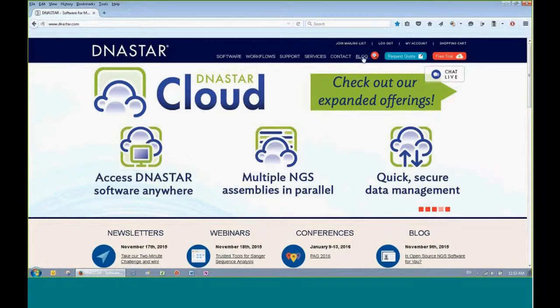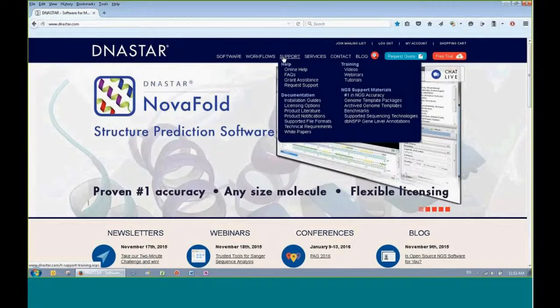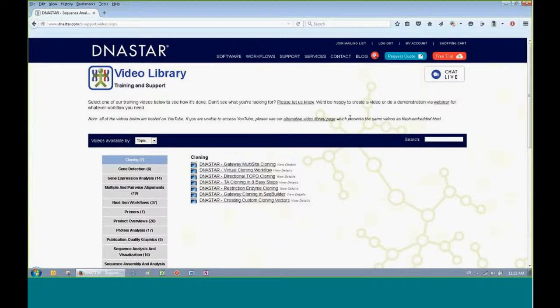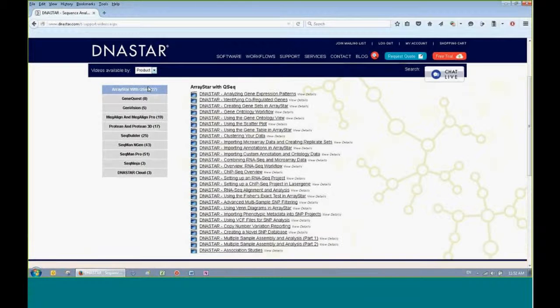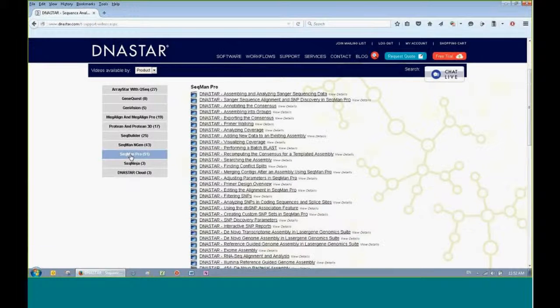We have quite a large collection of videos, and Katie showed you some of those at first, but I'll show you one that's related to today's talk. So you go to support and then videos, and you can see that they're currently organized by topic. I'm going to change that to product. I'm going to uncheck ArrayStar and check SeqMan Pro. And you can see that the second video down from the top is on Sanger sequence alignment and SNP discovery, which Katie talked about and did a demo of today.